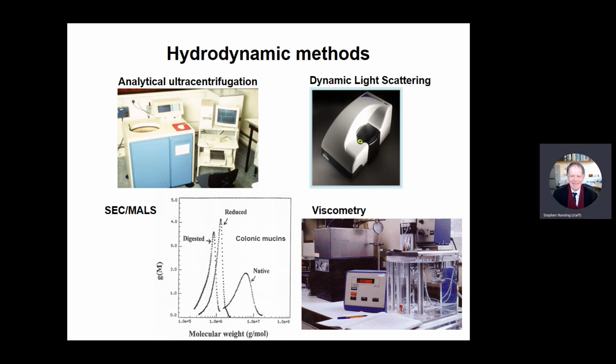We'll do this when we do our electrophoresis lecture with Glad next week. These thiol reducing agents are the most obnoxious, smelly molecules about. It's not the worst. The worst molecule we've encountered is one called TEMED, which has a horrendous smell. But anyway, that's something else.